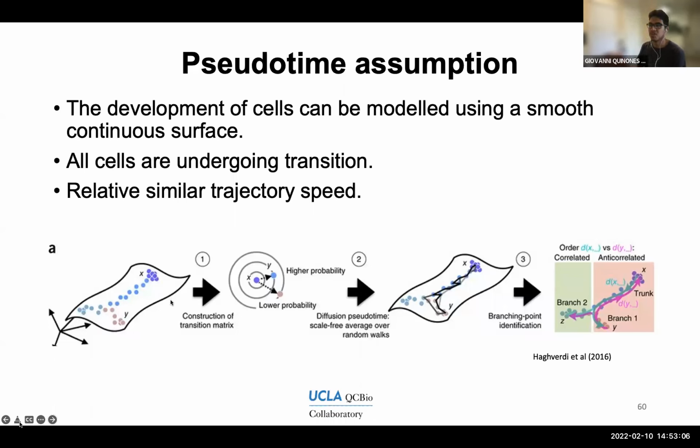So at this point it's good to clearly establish the differences between dimensionality reduction and pseudo-time analysis, because these are different things, but just because we're talking about multiple dimensions, it may be confusing. PCA and UMAP and t-SNE, which is another method that we didn't go through, are all dimensionality reduction.